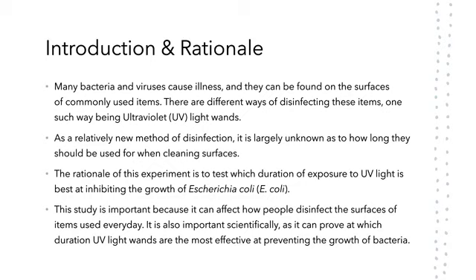At the beginning of the pandemic, a new way of disinfection burst in popularity, which was the UVC light wand. It must be noted that UVC light has been used by scientists and medical professionals in the past, but now the general population has become much more interested in it. After hovering a UVC light wand over a surface for a mere 30 seconds, it should supposedly get rid of all surface bacteria. However, since this device is a newer and therefore less known method of cleaning, it is unknown how long it should be used for.